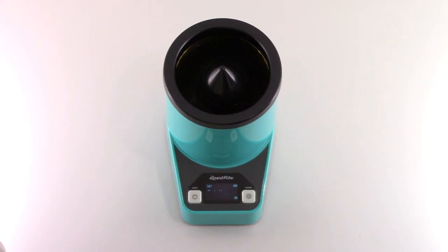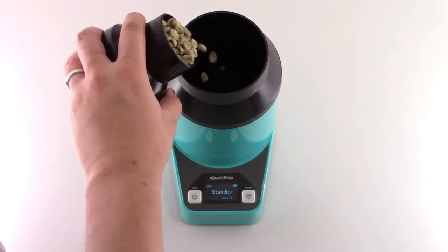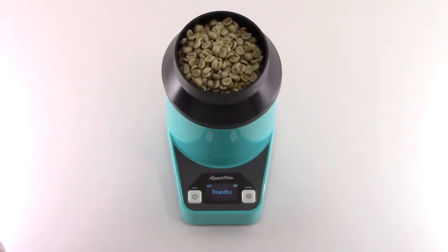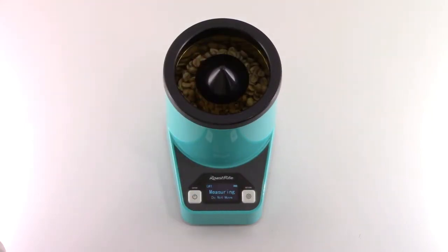Remove the hopper then press the left button to start the measurement procedure. When the on-screen prompt appears, place the hopper on the device, then pour the coffee beans from the sample cup into the hopper. Pull up the hopper and let the coffee fall into the cylinder — the device will then automatically begin the measurement.